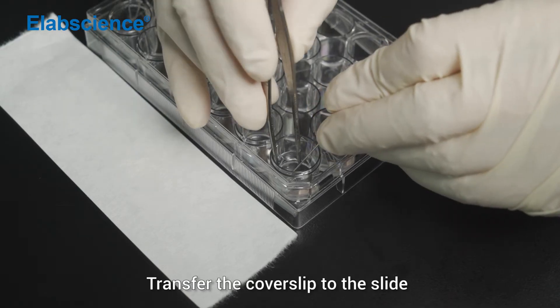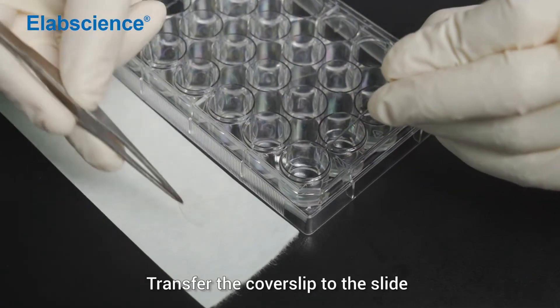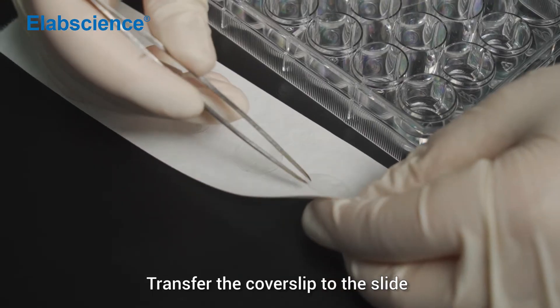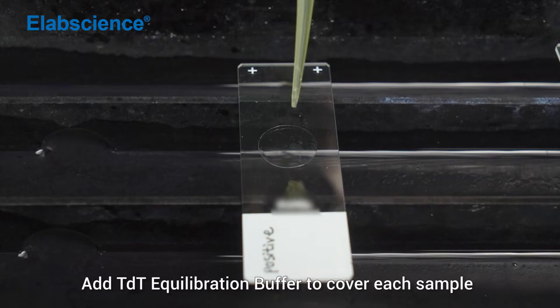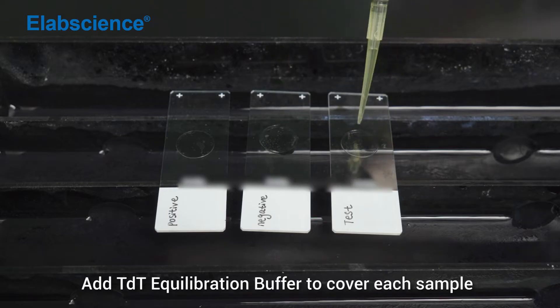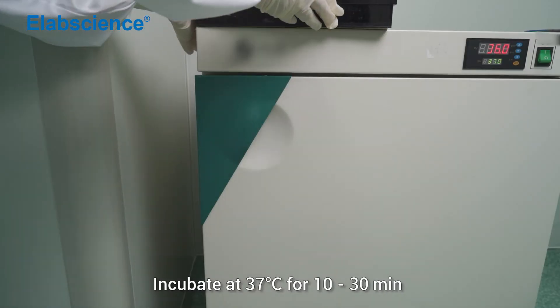Transfer the cover slip to the slide. Add TDT equilibration buffer to cover each sample. Incubate at 37 degrees for 10 to 30 minutes.